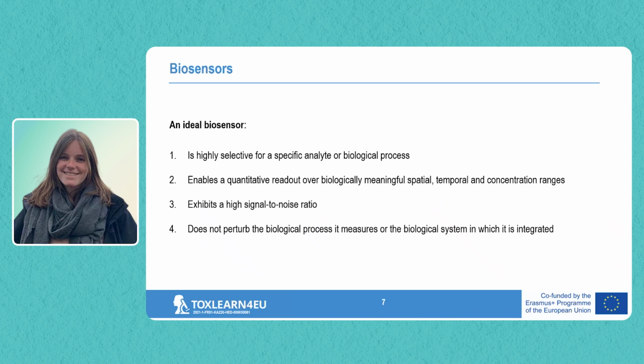If your sensor only responds to super high hydrogen peroxide levels, but you only have very low levels in your cells, then it will also not work. So those are all things to take into account.